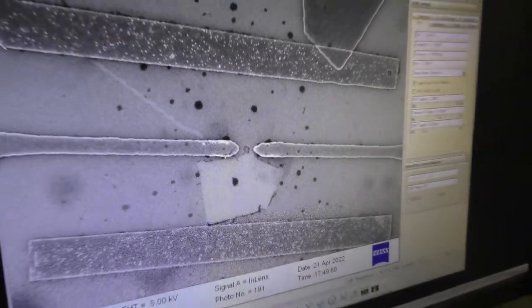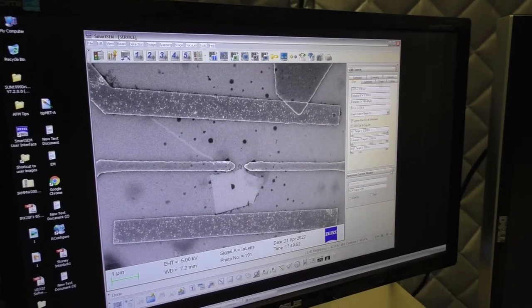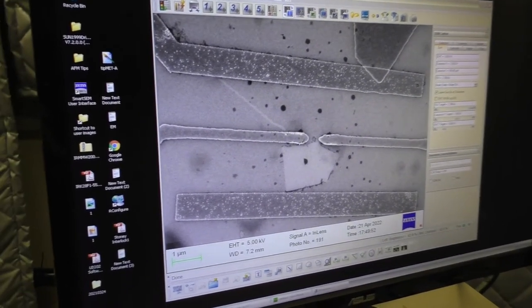We can also slow down the scanning speed. Here we can clearly see how the electron beam spots scans over the sample surface line by line.